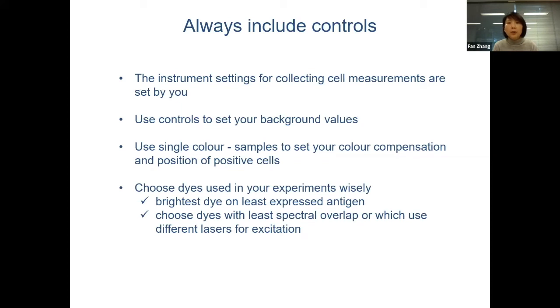Always include controls. The instrument is set by users, so you need to choose the parameters appropriate to detect your fluorophore in the sample. Use a negative control to set your background values. Use single color controls to assess the spillover and perform color compensation. These are the basic rules for panel design. Brightest dye on least expressed antigen, choose dyes with least spectral overlap, or use dyes that are excited by different laser lines.